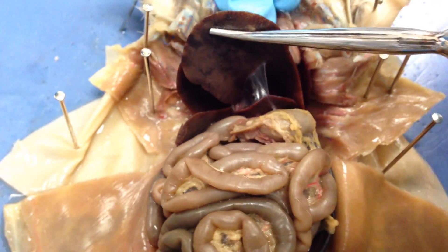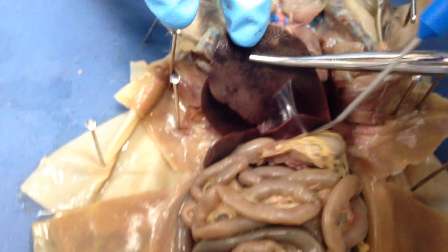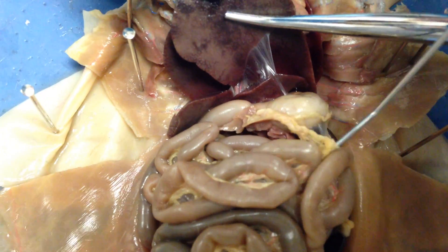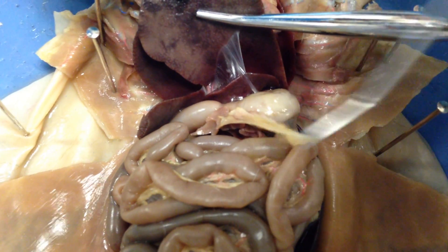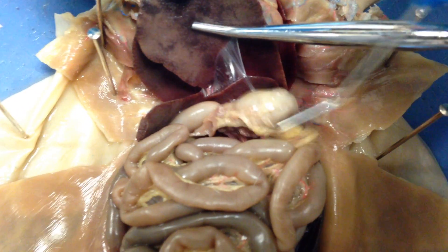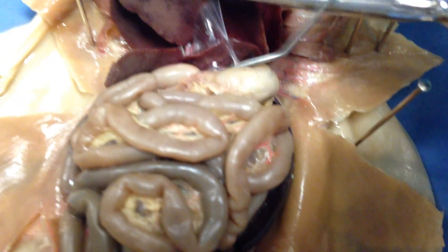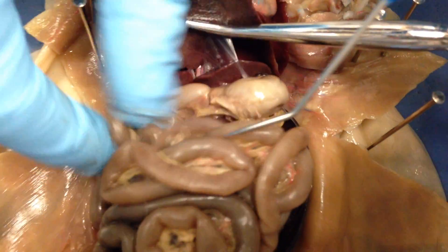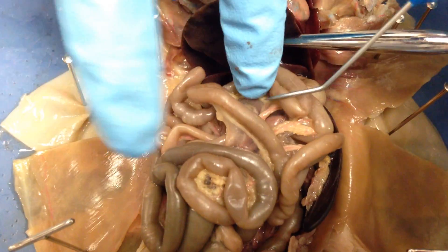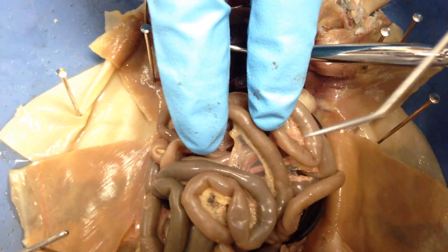Push these up so I can see past it. Right here we have our stomach — the stomach falls right underneath. This stuff right here is your pancreas; this little gooey stuff, that's your pancreas. You follow this down and all of this is your small intestine. Now, your small intestine is much larger — much longer — than your large intestine.